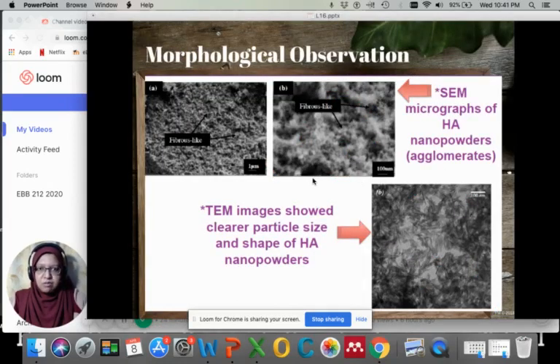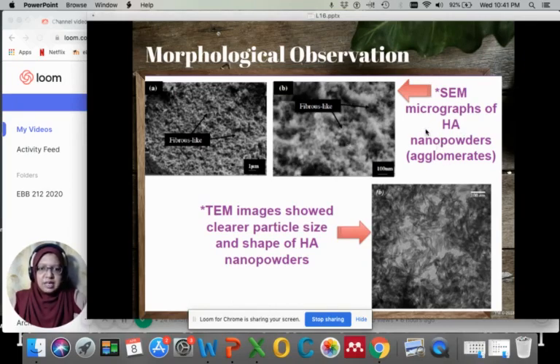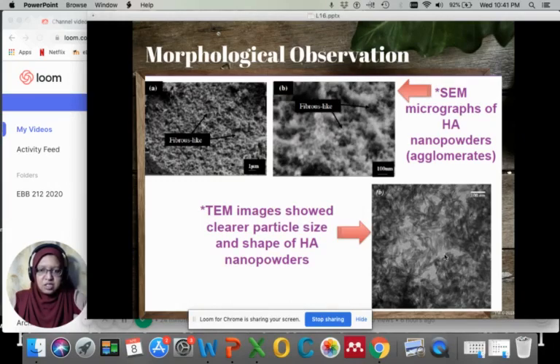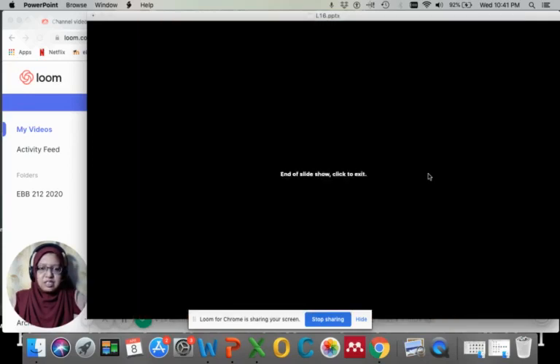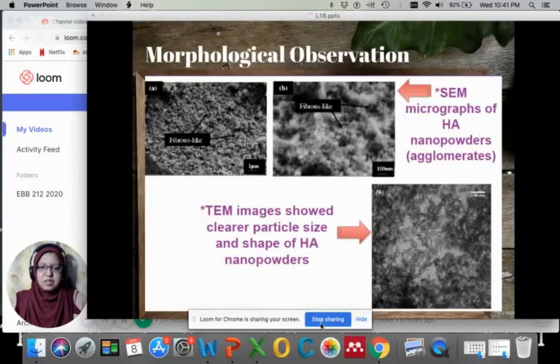This is an example of morphological observation. The top image shows an SEM micrograph of hydroxyapatite nanopowders. You can see how agglomerated they are because they are very fine powders in nanometer size. The same powders were also observed under TEM, and we can see a clearer particle size and shape of the HA nanopowders compared to the SEM image. That's all for physical characterization of materials.